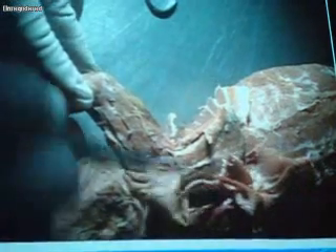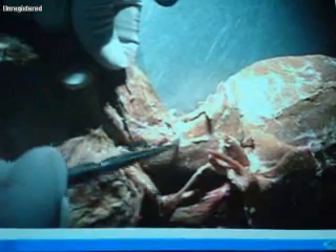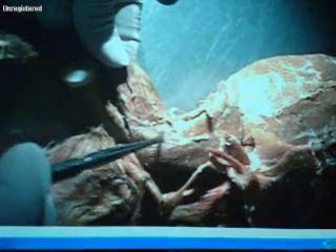So again: infraspinatus, supraspinatus, teres major, with acromiotrapezius sitting on top. Now going underneath the acromiotrapezius — moving the acromiotrapezius and the levator scapulae ventralis out of the way — we have three muscles in succession. There's a raphe right here, and three muscles one after another.